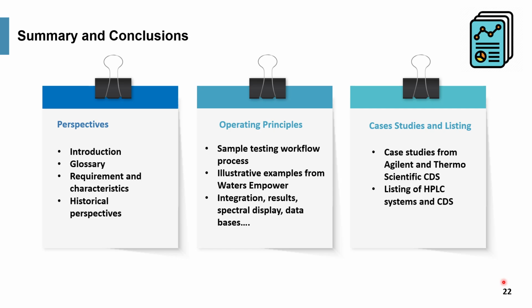Here's my summary and conclusion, right? First segment is the perspective: introduction, glossary, requirements, characteristics, historical perspective. Second is operating principle. We mentioned our sample testing workflow. We illustrated examples from Waters and Empower, showing you integration, the results, spectral display, and databases. Finally, some case studies, also from Agilent and Thermo Fisher Scientific on CDS, and a listing of HPLC systems and also their corresponding CDS.